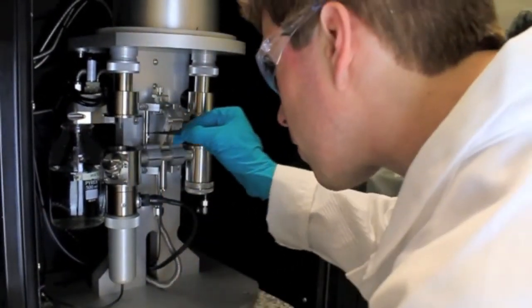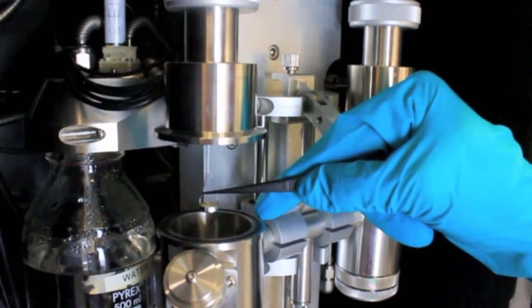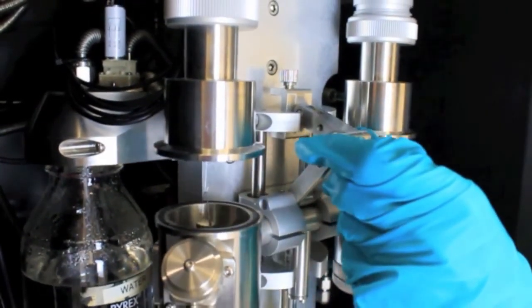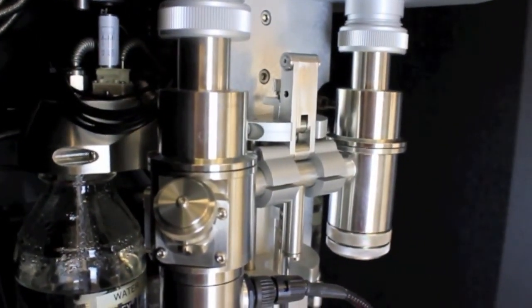And that small sample will be exposed at a constant temperature to a user-selected humidity. So we'll select a humidity and we'll measure the way the mass changes. Sometimes the mass will decrease as the sample gives up water, and sometimes the sample will actually increase in mass as the humidity increases. And from the amount of water taken up by the sample and the rate at which it takes up, we can learn a lot of information about the way the material is going to behave.